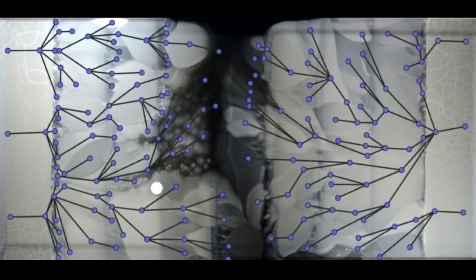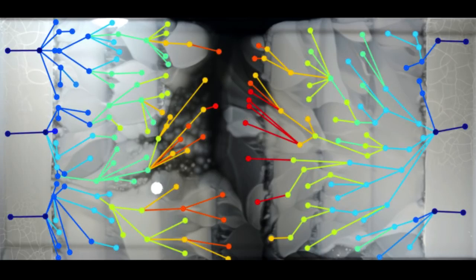And then you see the different mutants repeat this at 100. And after about 11 days, they finally make it into 1,000 times as much antibiotic as the wild type can survive. And so we can see by this process of accumulating successive mutations that bacteria, which are normally sensitive to an antibiotic, can evolve resistance to extremely high concentrations in a short period of time.